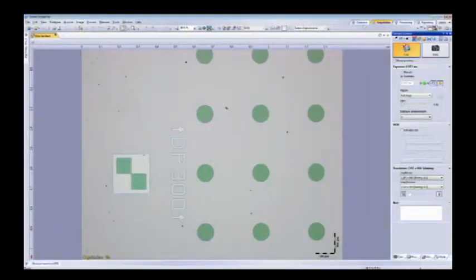Okay. Back to our acquisition screen. Stream has a workflow process to streamline the work. You start with the database, you take acquisition, you capture your images, you process the images and create reports. Similar to some of the other software I've seen from Olympus, you've got tabs, a way to work your way through the process visually, right on the screen. Yes, exactly. The screens can be customized and simplified for different levels of users, so different people log in. Beginner users could have very simplified screens. The engineers could have more screens that they're going to interface with.